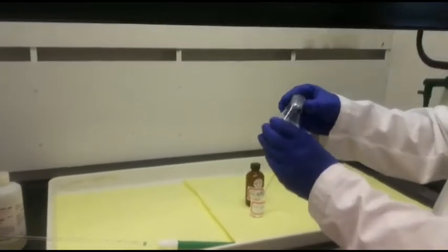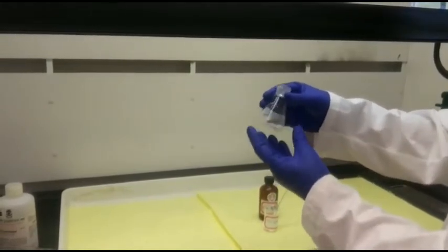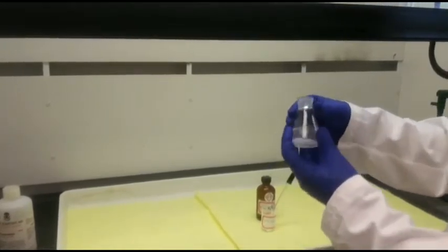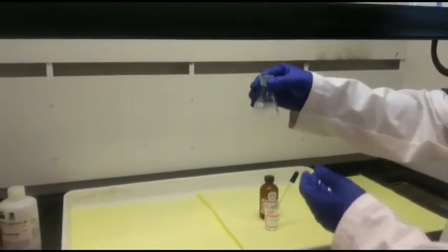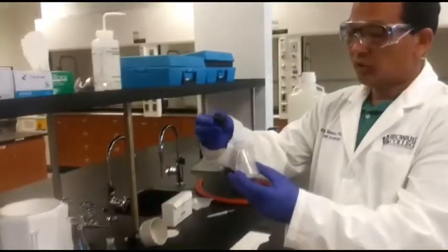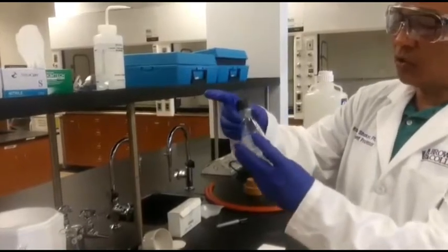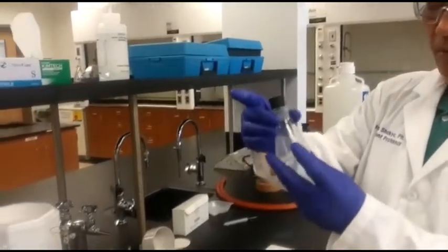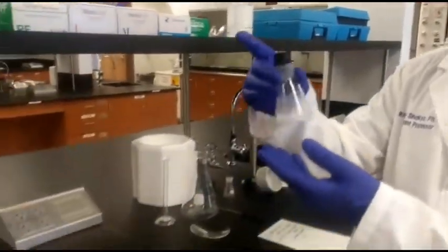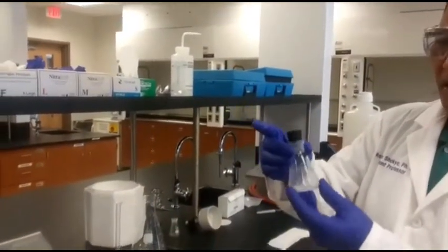And I need to swirl this reaction very well. As the reaction is exothermic, it will give a little bit of heat, so this needs to be swirled for some time, and we can cap it with the stopper. Here there is a cap for that, and we can swirl it for some time. In order to complete the reaction, this mixture can be slightly heated in the hot water bath for about 10 to 15 minutes.